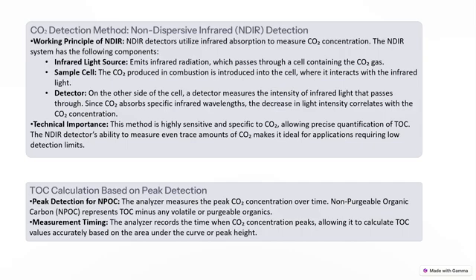In the working principle, we have the NDIR detector detecting CO2 by measuring the absorption of specific infrared wavelengths by the gas. It has different components like an infrared light source, a sample cell, and a detector. I will now explain the use of these different components.